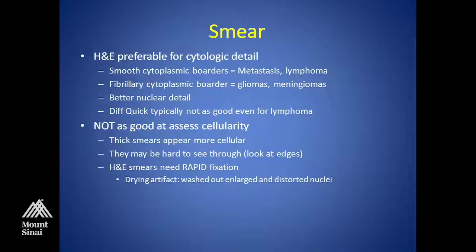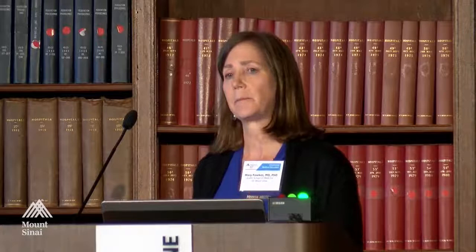One of the problems with a smear is that you can get drying artifacts if you don't rapidly fix it. Another problem is that you can't assess cellularity very well. Thick sections of the smear are going to look very cellular, while thin areas will look like there are not many cells. Reading through really big clumps of tissue can be problematic, especially if the tissue doesn't smear. If that happens, try to look at the edges of that mass of tissue — you can usually get some cytologic detail from there.